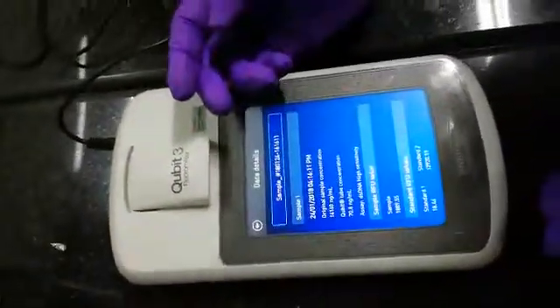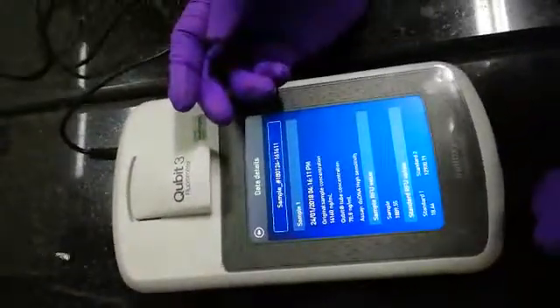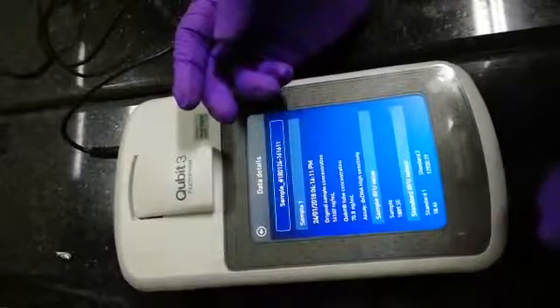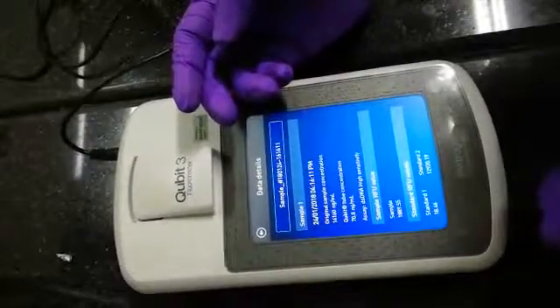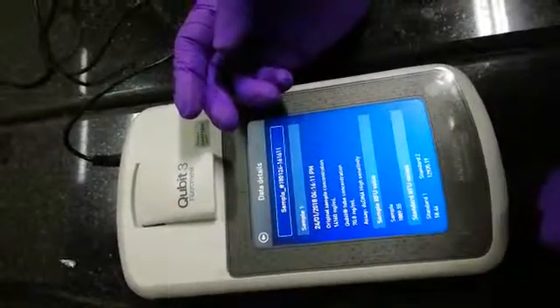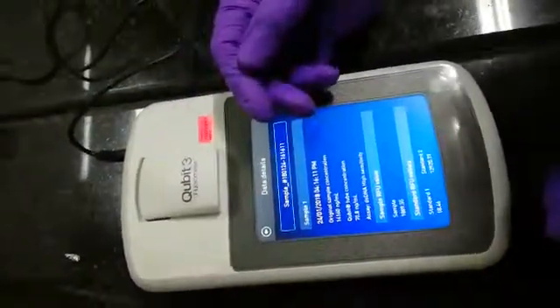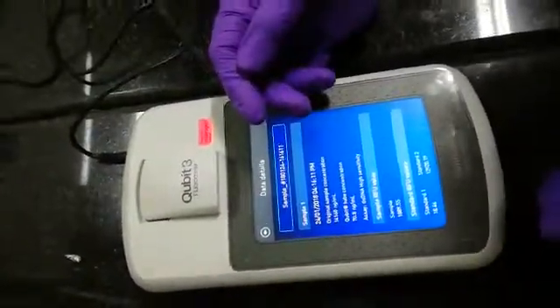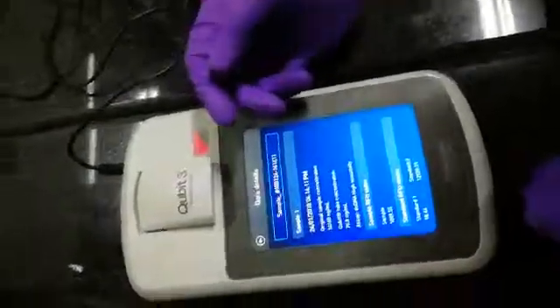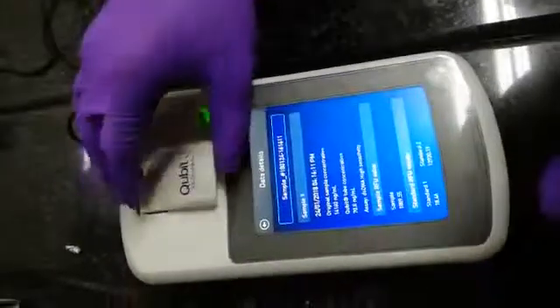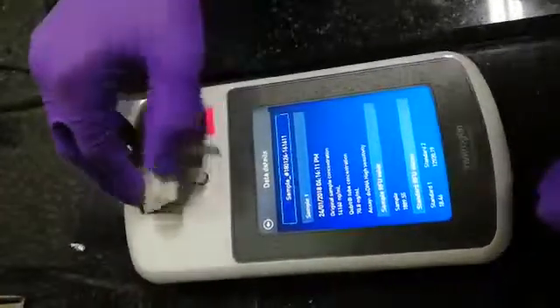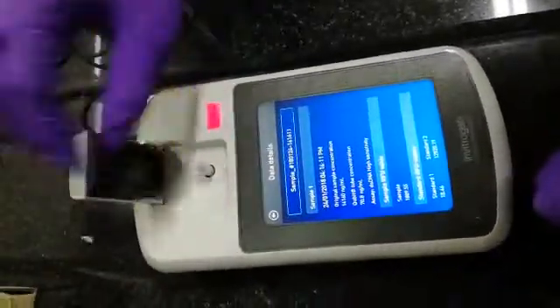So 14.16 nanograms per microliter multiplied by 25 microliters gives 350 nanograms of DNA total. So you have 350 nanograms of DNA. This is the simple Qubit fluorometer and its uses. Thank you for the class.